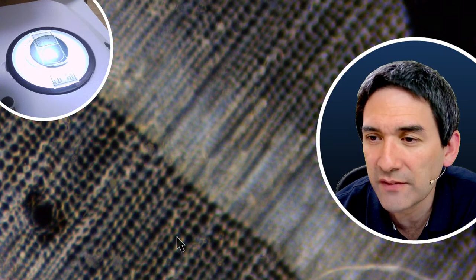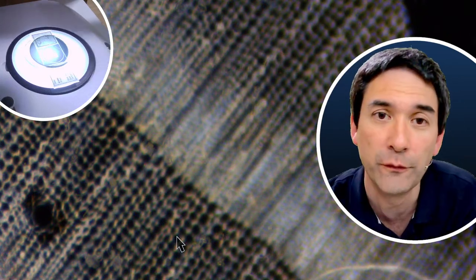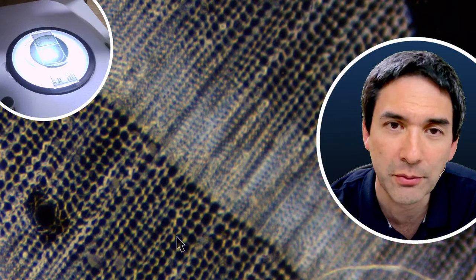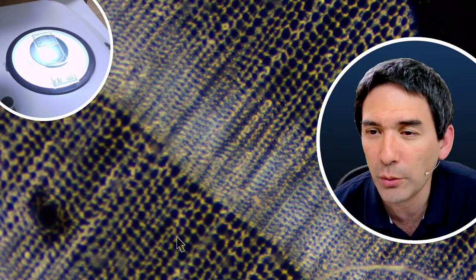Can you see crystals vibrate under the microscope? Well, not vibrate, but I can actually show you in just a minute. I want to show you how crystals actually form, because I'll be dissolving a little bit of aspirin in some alcohol, and the alcohol evaporates very quickly, and therefore you can actually see crystals growing. In time lapse, the crystal growth can be observed very nicely.